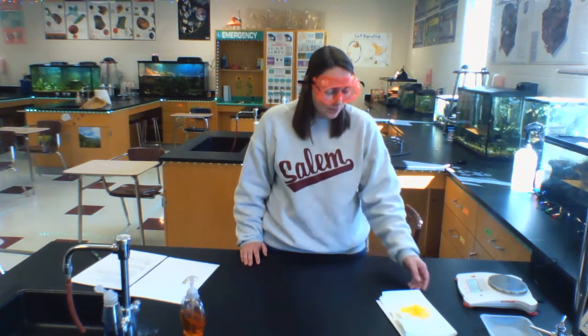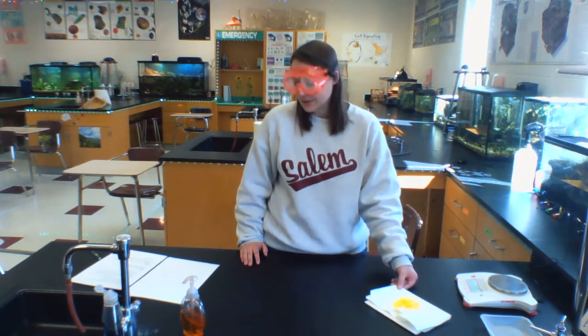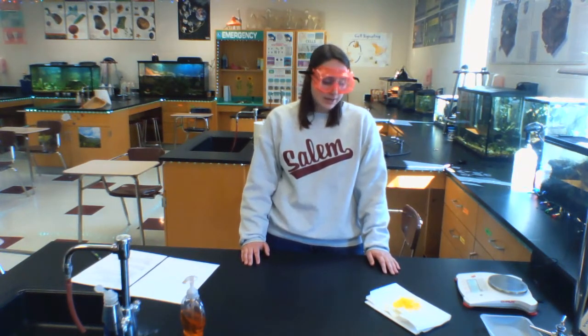Everyone, it's Larson in the lab for day 3 of our stoichiometry lab. Today we are going to find out how much product, how much precipitate, was made in this reaction. Yesterday we had to decant and then filter out our precipitate from our reaction using filter paper. We left our filter paper on a paper towel, and it's been drying for about 24 hours. So today we are going to find out how much of that product is actually here on the filter paper.